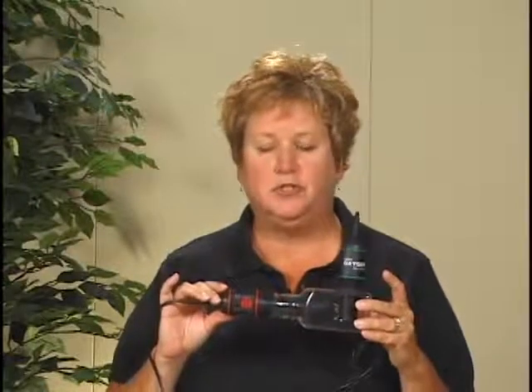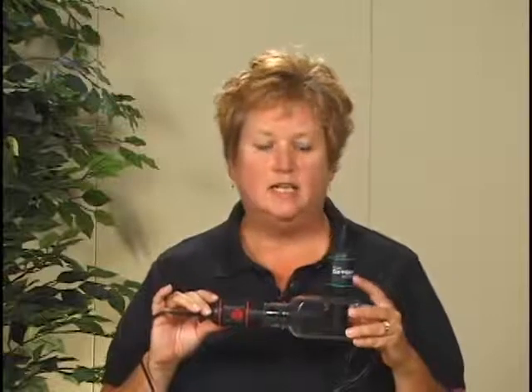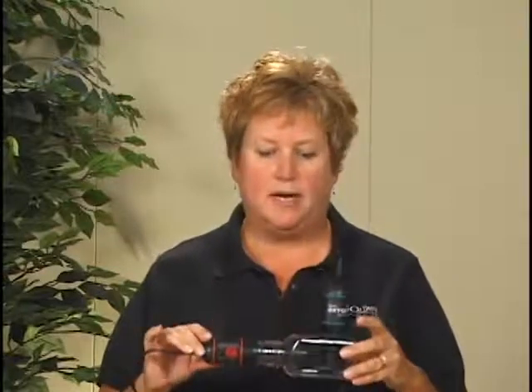In this experiment, we will be using both a CO2, carbon dioxide gas sensor, and an O2, or oxygen gas sensor, to measure the amount of CO2 that's produced by germinating peas and the amount of O2 that's consumed by the peas. One nice thing about this experiment is that it can be performed in 10 minutes, as opposed to the lengthy experiment required by traditional methods.